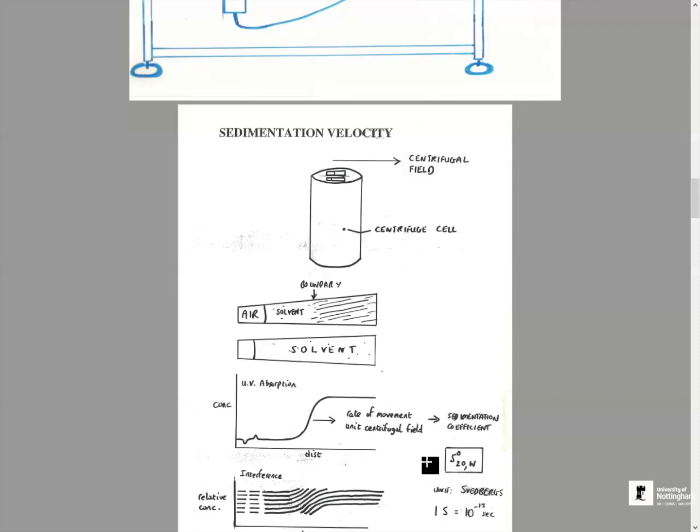Okay. For the ABT Abbey students, in the self-assembly macromolecules book, which we've given you, or the one that's on the Moodle, this is incorrectly given as seconds to the minus 1. The unit is Svedbergs or seconds. 1 Svedberg is 10 to the minus 13 seconds.